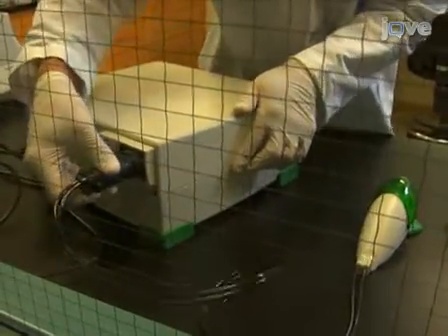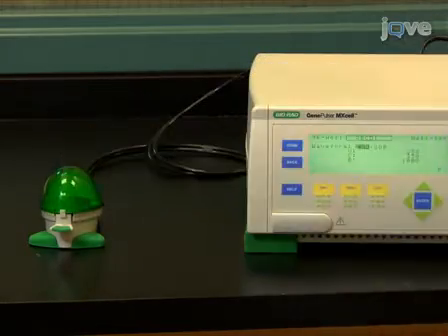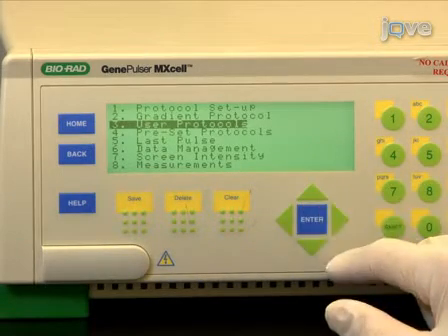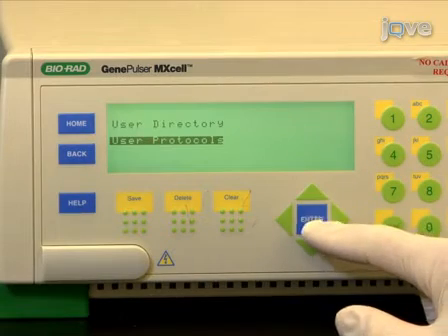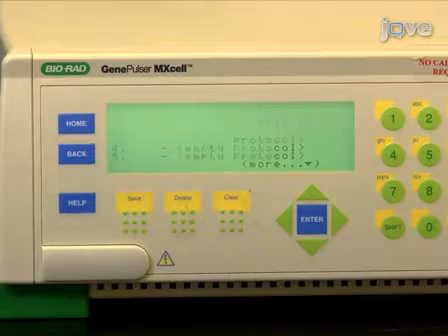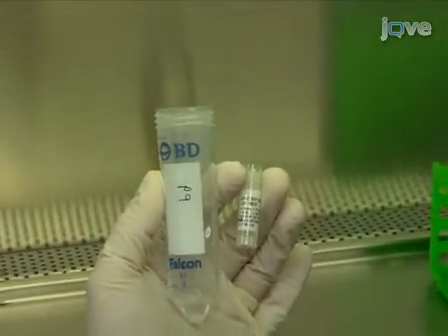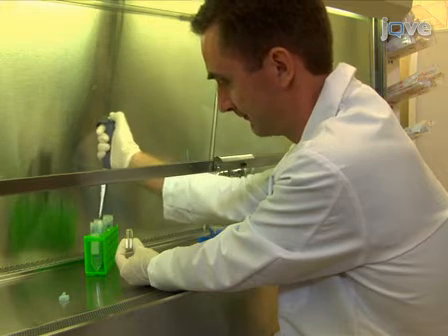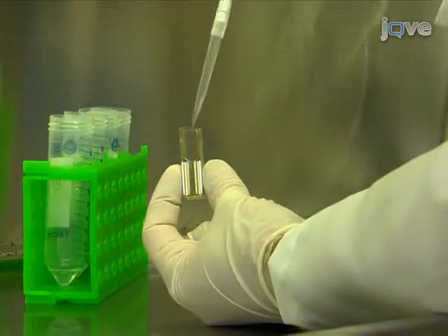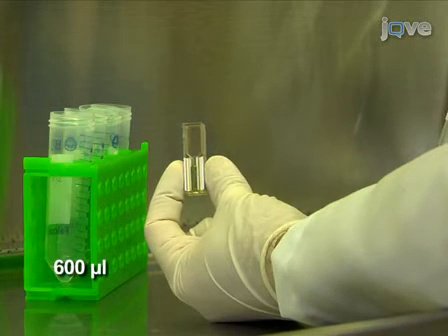Unplug the plate chamber from the back of the instrument and plug in the shock pod. Since the shock pod only delivers the pulse programmed for well-set ABCD1, a different program may need to be selected. To select a previously saved program, press Home, then select Option 3, User Protocols. If you are already in the correct user folder, press Enter to select User Protocols and scroll down to highlight the correct program. Press Enter to select that program. The instrument is now ready. Set up the cuvettes — the mixture of plasmid and MEFs is prepared in the same manner as previously shown. Load each 0.4 cm cuvette with the same volume used for an entire well set in the 96-well plates. Since a well set is 4 wells and 150 µL of either buffer or cell mixture was used per well, add 600 µL of the plasmid cell mixture per cuvette.